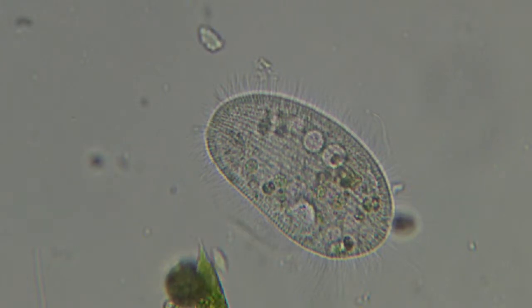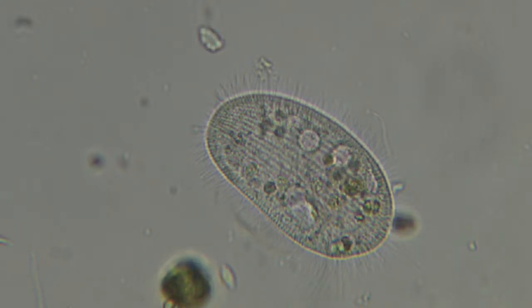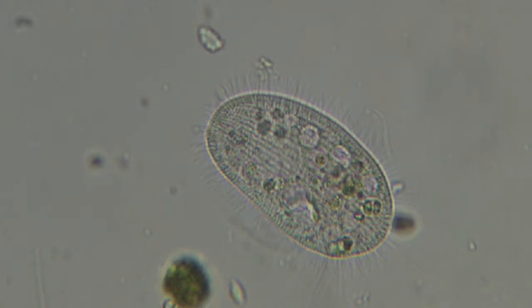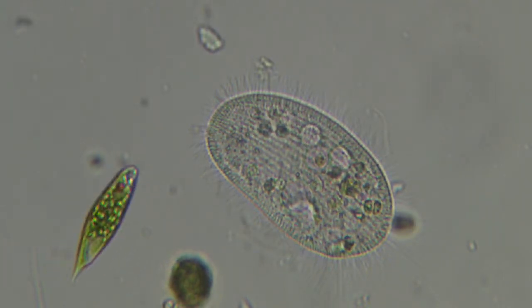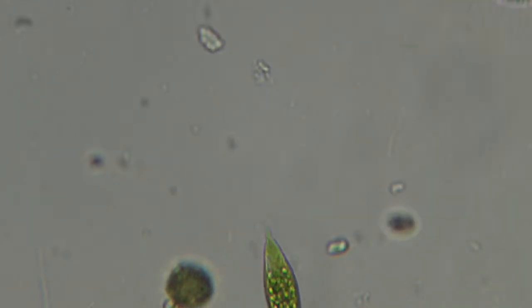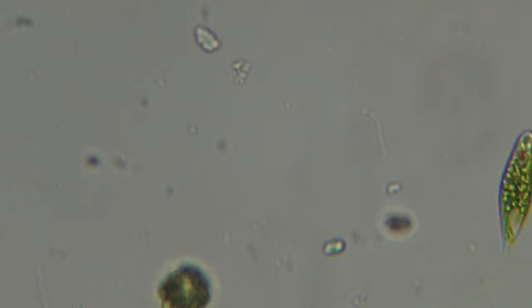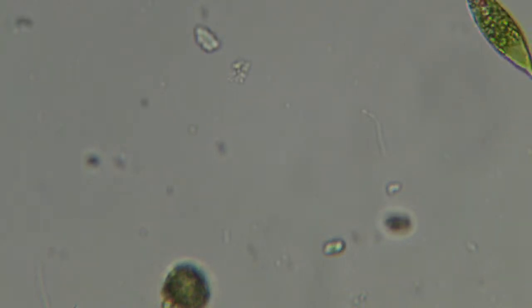Because they're salty like we are, and they're in salty water, but not nearly as salty as the internal cell contents are. Similar. Ocean water is similar to your cell, but still more water than salt. And so the battle is to pump water out of the cell as it gets in. Well, he's going crazy now. So when the cell starts to die and that contractile vacuole stops pumping, you'll see the cell start to inflate like a balloon and lose its normal shape and get this big kind of inflated round shape, and then eventually will pop and all the contents go flying everywhere.